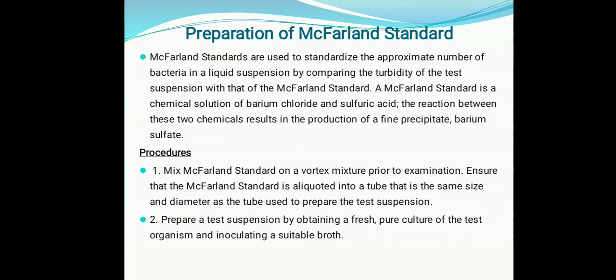Before we proceed with the steps or the procedure of the Kirby-Bauer disc diffusion method, we need to get ready with the materials required. One of the materials required here is the McFarland standard. So how do we prepare this McFarland standard?